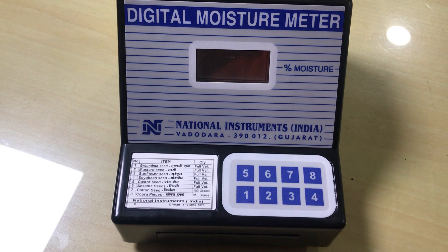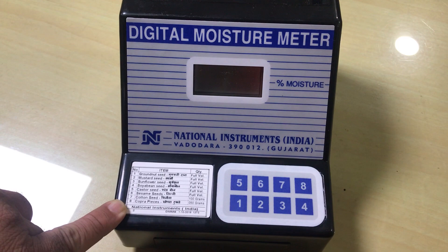This is the moisture meter, model DMM8. Various items are listed on the sticker. You can see the moisture content of the products.